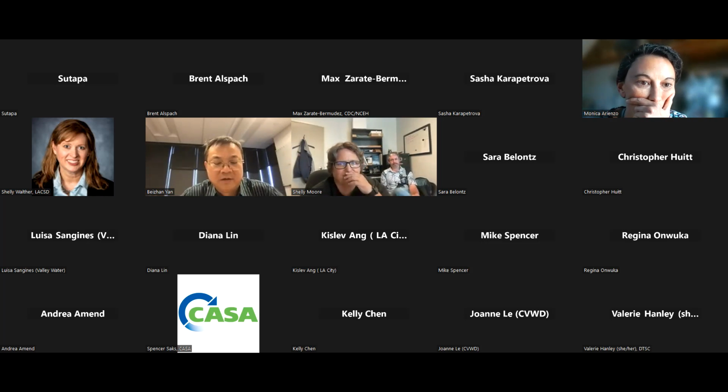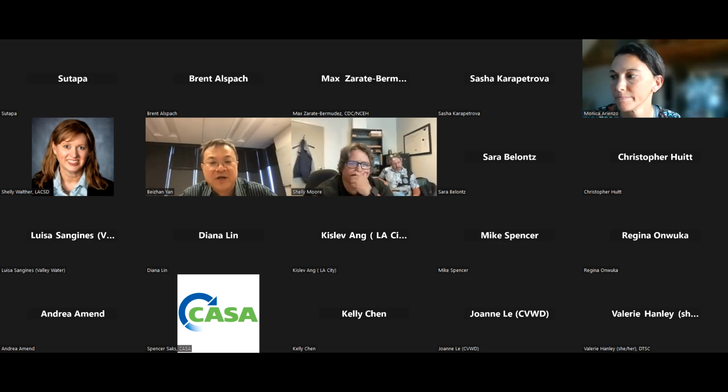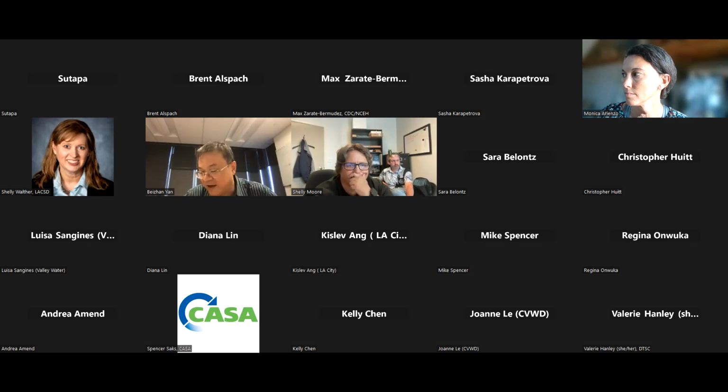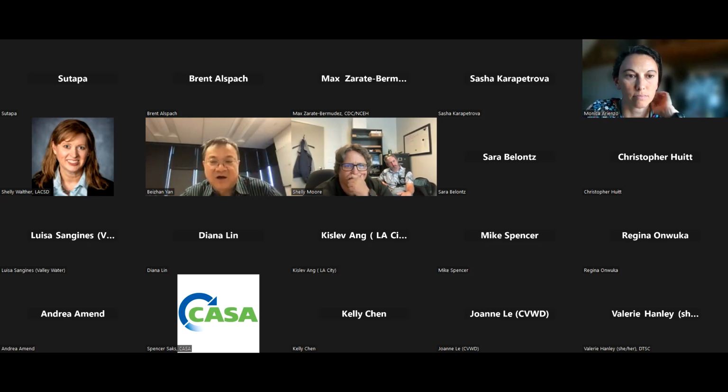this Raman is commercial, or is it just available within the lab itself? So yes, this is available commercially. But the problem is not really the instruments, it is basically the time spent and the training to get your technicians able to run the instruments and to identify the particles. As you know, Sarah did a great job showing the AFM-IR, but the ability to identify them, and then tuning the systems to actually measure them, is a lot of training.